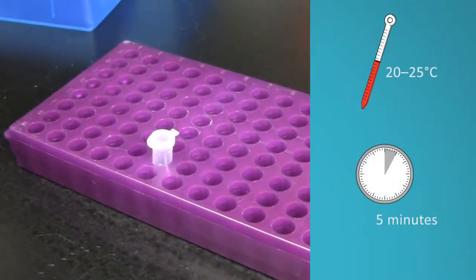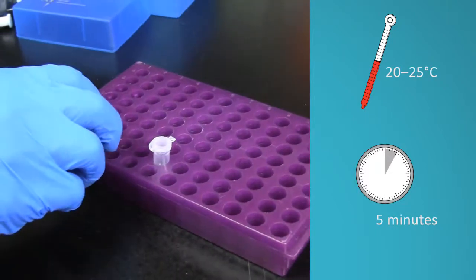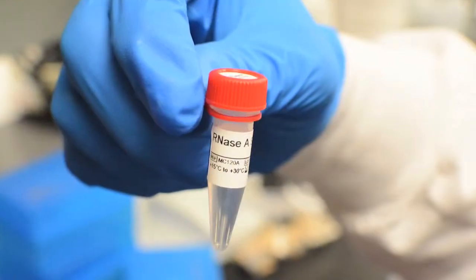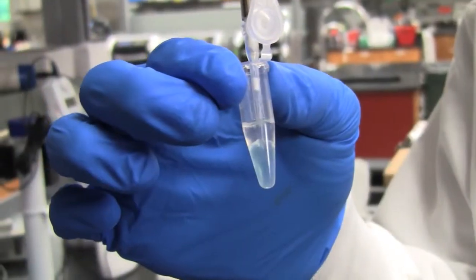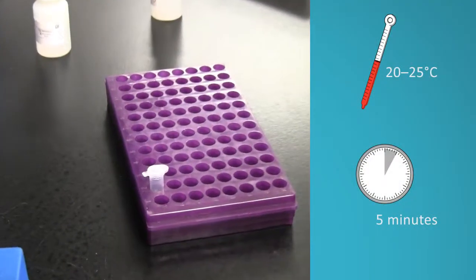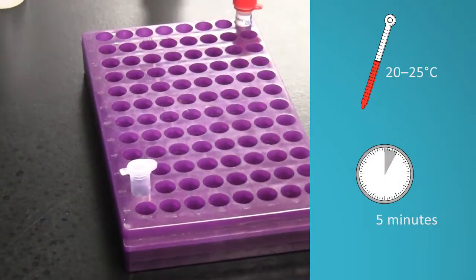Allow the sample to cool to room temperature for 5 minutes. Add 10 microliters of RNase A to each sample tube and mix by pipetting. This will ensure that only DNA is purified. Incubate for 5 minutes at room temperature to let the RNase do its job.